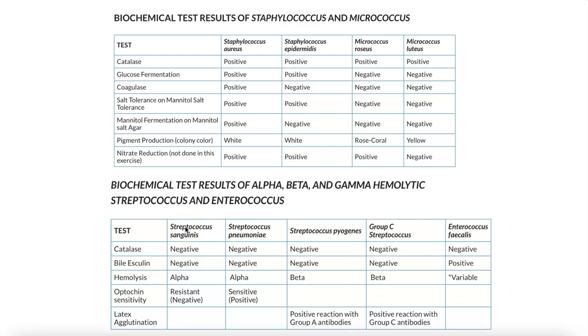So it's a total of 9 possible gram-positive bacteria, either staph or strep. And based on what we just said, the catalase test is going to be really critical in determining, is my gram-positive a catalase-positive staphylococcal organism, or is it a catalase-negative streptococcal organism?